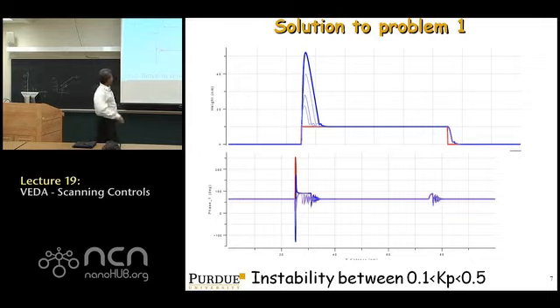So if you do that, then the Z topography of the top actually appears pockmarked because it's going up and down, up and down. It's basically become unstable, the controller. It just goes up and down, and even the top of the topography is not flat. It's like this because the Z is just hunting up and down because it's overreacting to changes. So really neat. If you went just a little above, you'd get this instability. This is an example you're going to work out on Tuesday in the class.